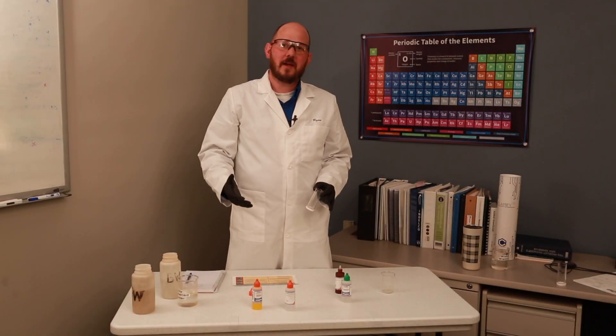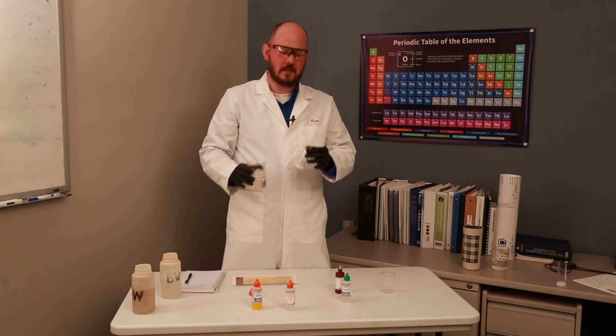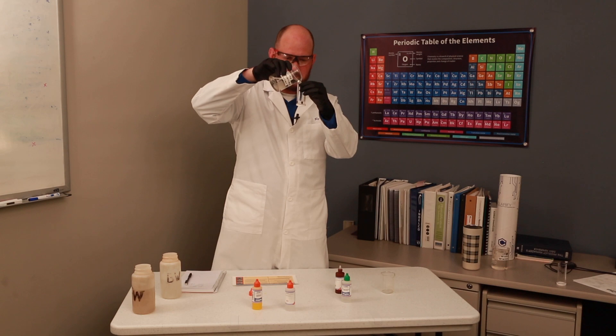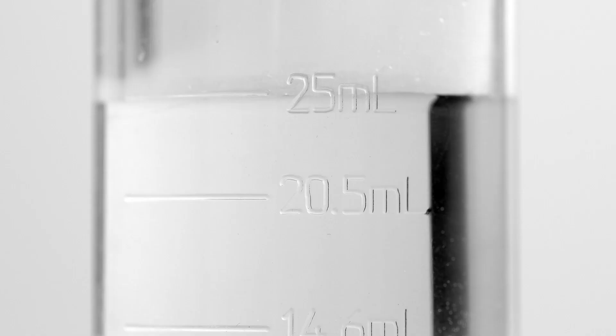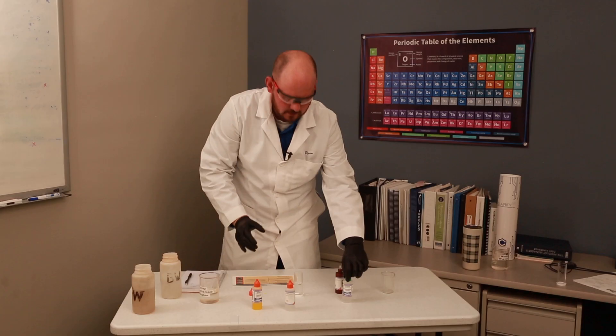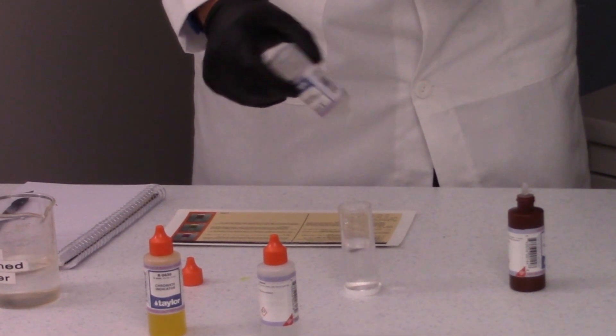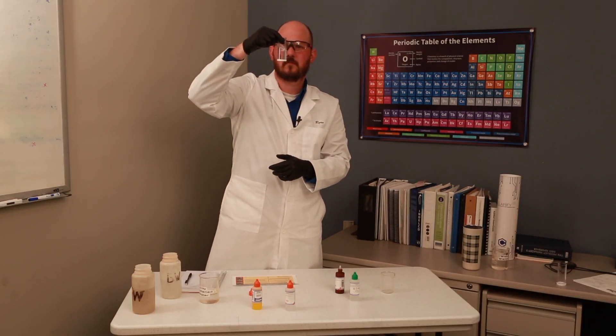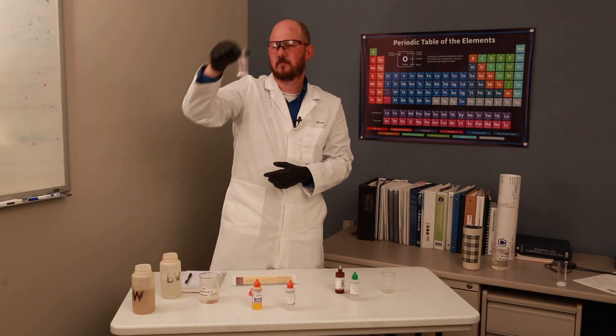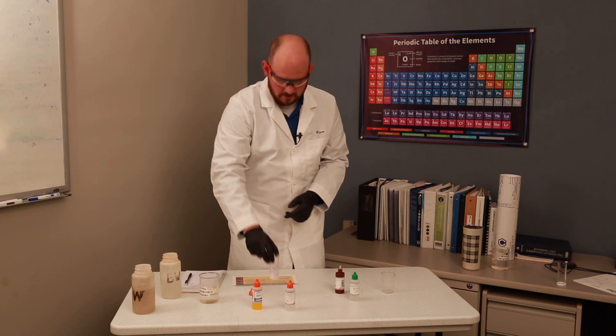All right, coming back to the same test that I said I was going to re-perform with the sample that needed the color change piece in the beginning - the pink. I'm going to begin by refilling my sample tube back to 25 milliliters. Taking my phenolphthalein once again and adding two drops. It looks slightly pink. It might be hard to see on camera. This one needs just about one drop of sulfuric acid.